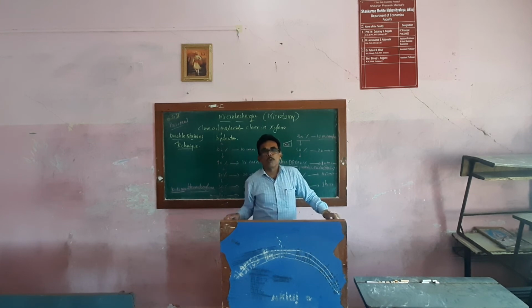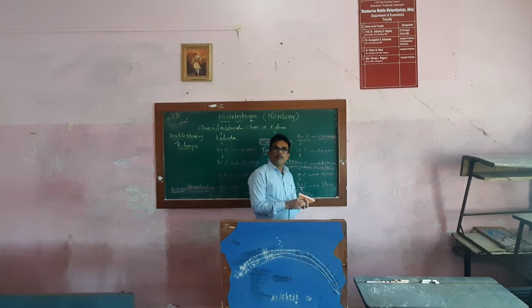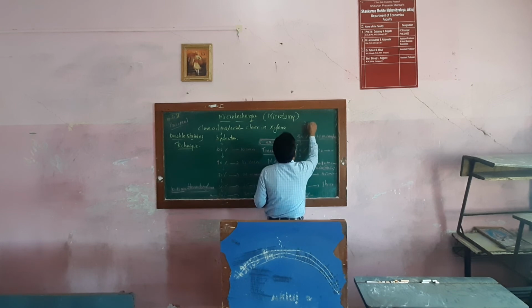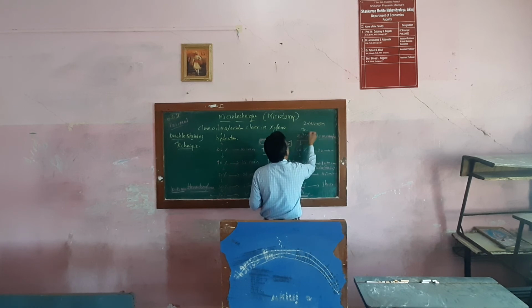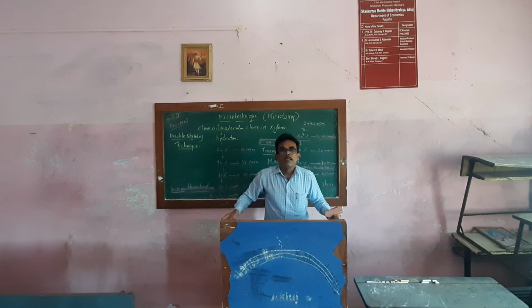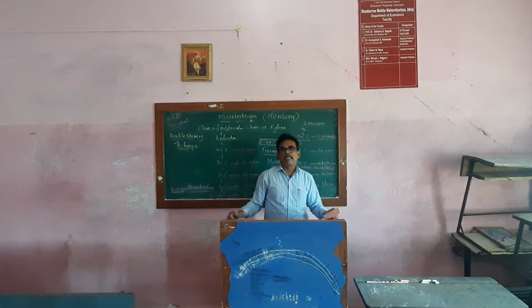The microtome machine has a particular section size of 2 micron, 3 micron or 4 micron likewise. As you wish, you set that micron size and get the sectioning.